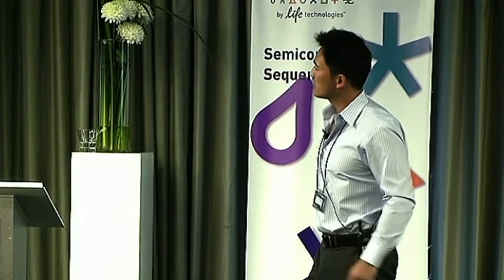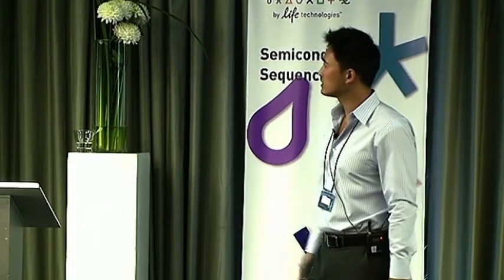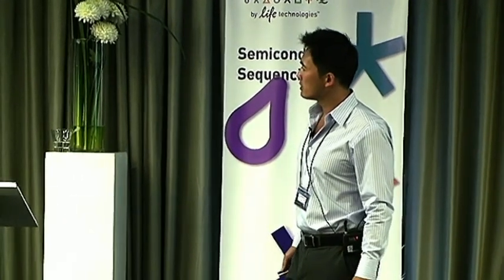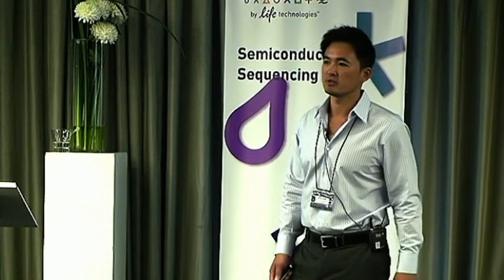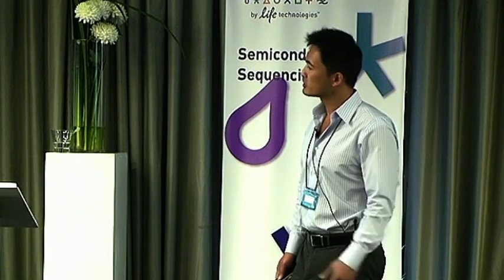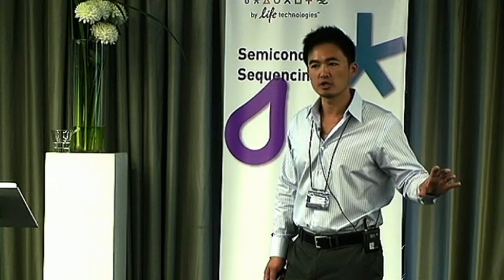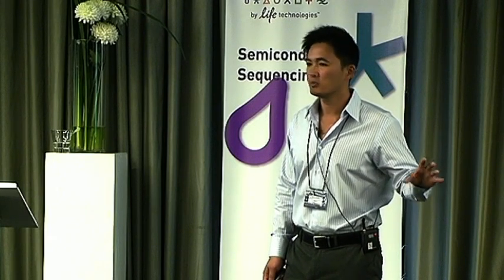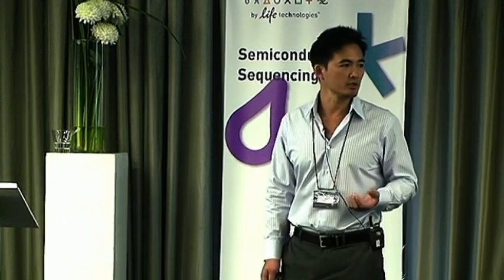So this was the technology. This was the original system that we're showing you here. It's called the NT cycler, OpenArray NT cycler. And the array itself, there's different formats. This is just an example here of, let's say, gene expression formats. So the numbers that you're seeing on the bottom of the array basically mean the number of markers that you're interrogating per panel times the number of samples that you can look at on a single array.